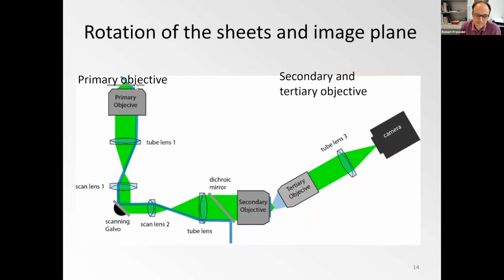So if you bring the sample there, it essentially is aligned. As long as all the stuff down here is not drifted, then you can essentially put the sample there like it's a normal microscope. Whereas anyone who has operated Lattice or any other high-end microscope knows that once you have separate objectives, if temperature changes, they change their focal lengths and walk away from each other. And so it just makes everything a bit more cumbersome.